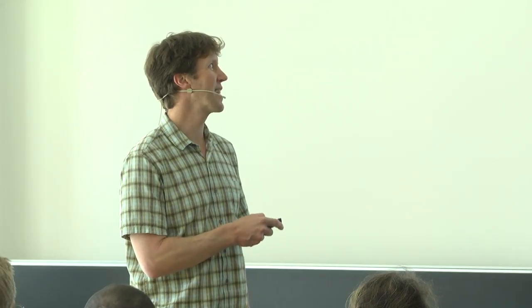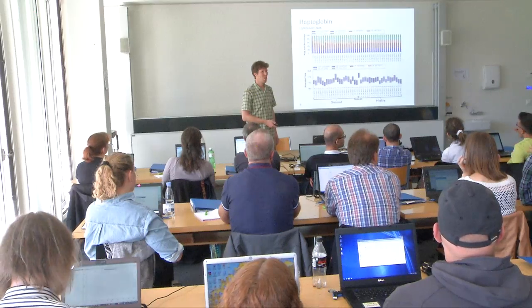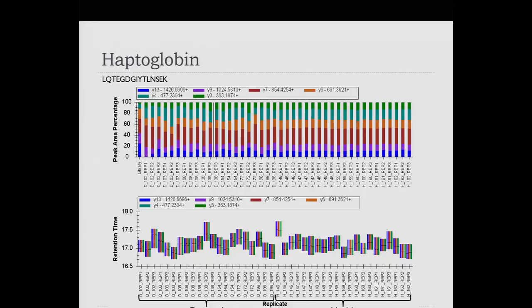So okay, let's go back to this top thing here, and who can tell me something that they notice about this? Sure, tell me. Yeah, so the variance over here, and these are the samples in triplicate. So you can see the subject number is here. The healthier diseased is the D or the H, and then you can see we have rep 1, 2, 3. So this is logically organized with all the disease on the left and all the healthy on the right.